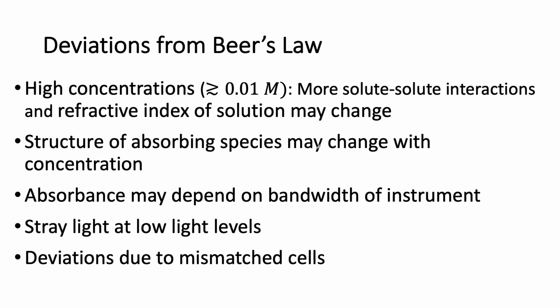And what happens is that whatever your sample is, it's not just surrounded by the solvent. The solute molecules are actually bumping into each other also, so you start to get solute-solute interactions. And that can change the absorbance coefficient.